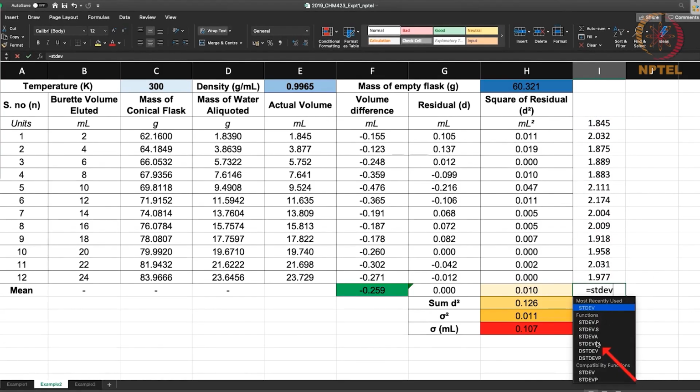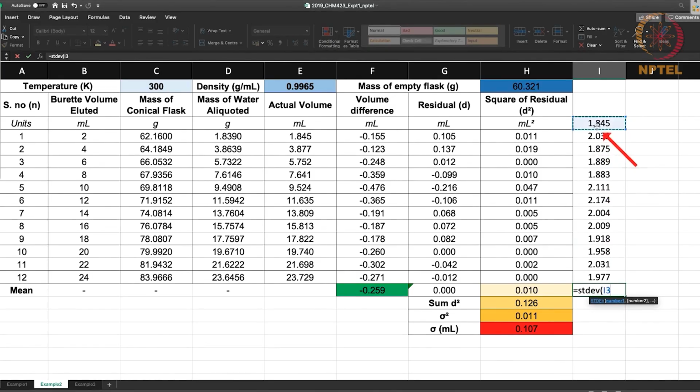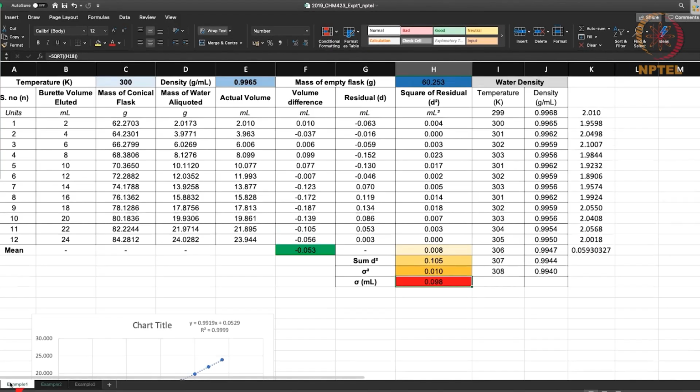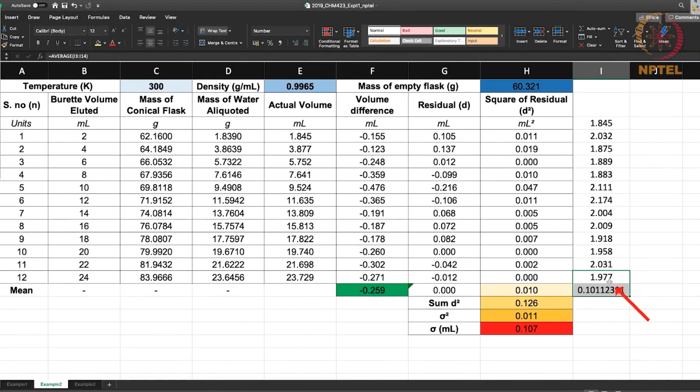You are able to realize it's coming close to 1.97, 98 actually, and the standard deviation is about 0.1. Now if you see the similar analysis done for the first researcher, they got 2.01 plus minus 0.06. In this case, this researcher gets 1.98 plus minus 0.1. So this once again indicates the second researcher has about twice the amount of error or lack of precision that comes in the measurement, however the average value works out.